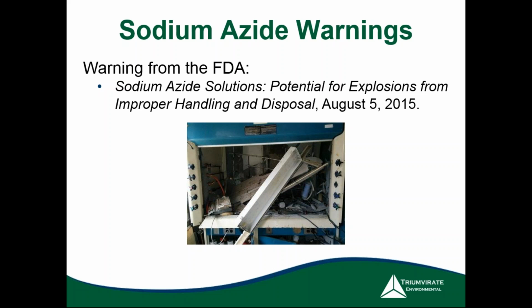As far as this picture goes, this was an explosion. I didn't take this. This is from the internet, but this was from an explosion at a university where a graduate student had 200 grams of sodium azide.